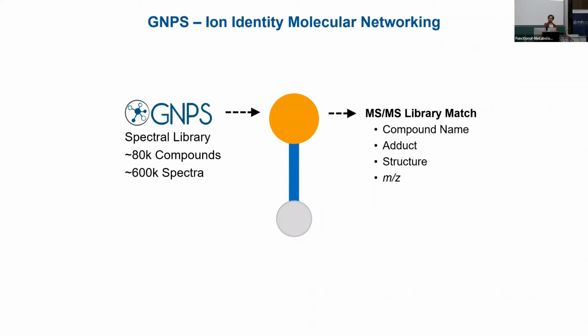Because in this annotation step, you will usually see that maybe 5%, maybe 10% of your data is annotated, depending, of course, on your study subject.